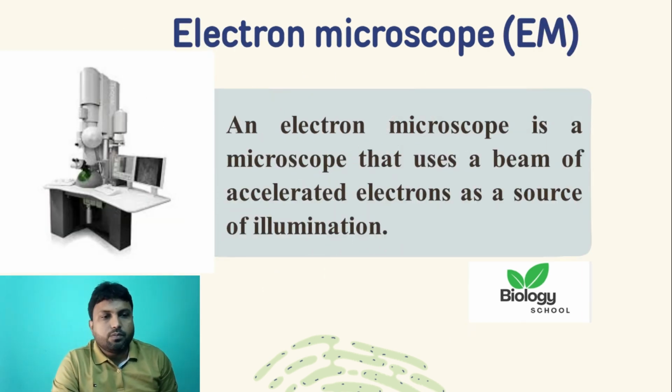An electron microscope is a microscope that uses a beam of accelerated electrons as a source of illumination. It is a special type of microscope having a high resolution of image, able to magnify objects in nanometers, which are formed by controlled use of electrons in a vacuum captured on a phosphorescent screen. Ernst Ruska, a German engineer and academic professor, built the first electron microscope in 1931, and the same principle behind his prototypes still governs modern electron microscopes.